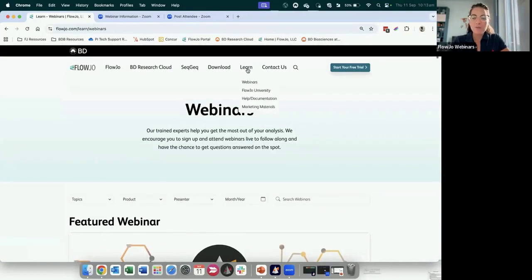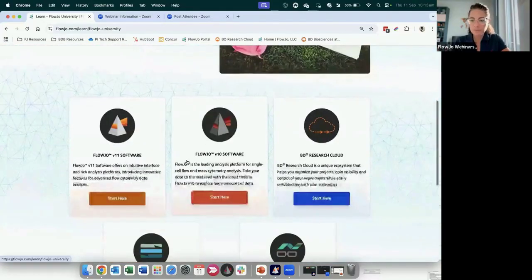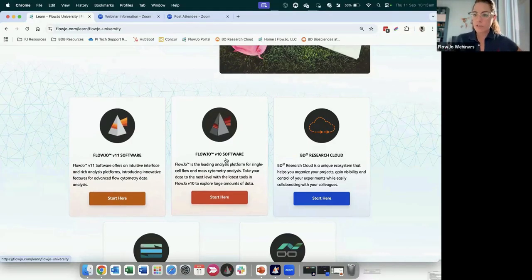The second thing that I want to mention is the FlowJo University. The FlowJo University is a repository of short videos. In case you don't have time to watch a full webinar of an hour, please feel free to check the FlowJo University right here, where we have short videos on how to perform actions or how to create something in both version 11 or version 10.